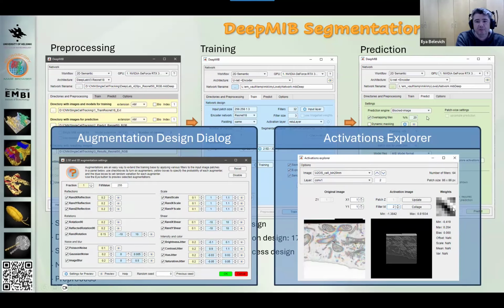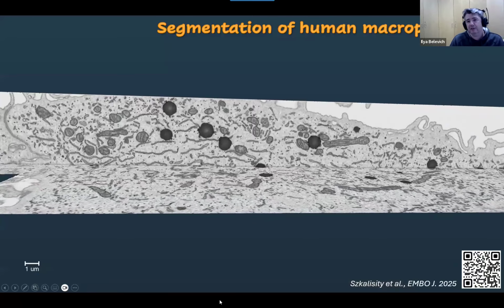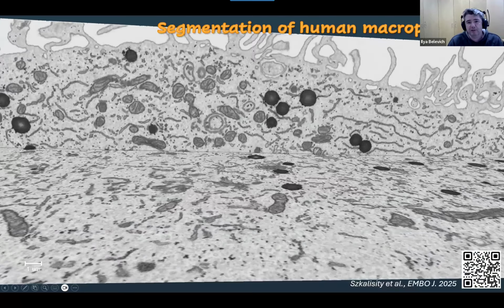You can see the weights, sort of the filters the network identifies, and see the activations, whatever the network produces at each layer of the network. So in this case, you can see that the network learned a filter that defines this diagonal pattern.